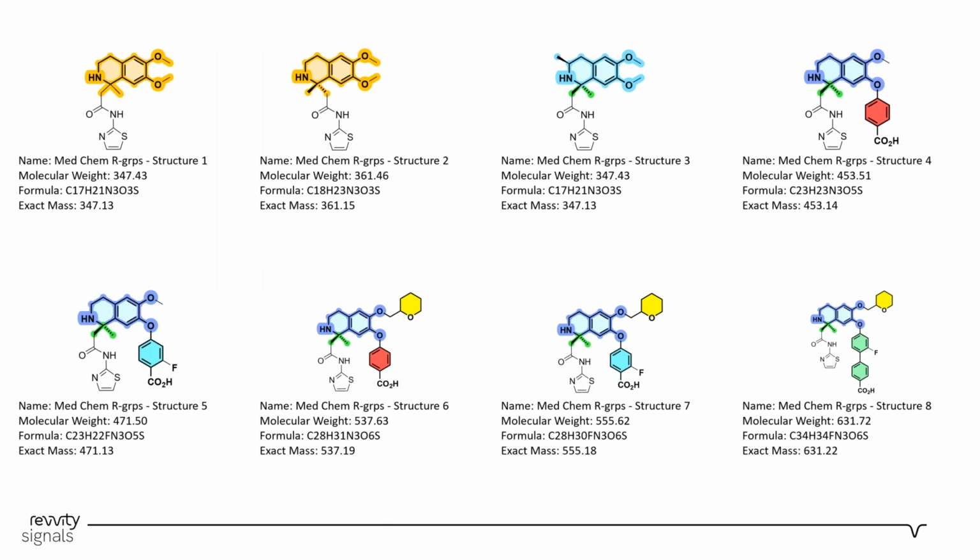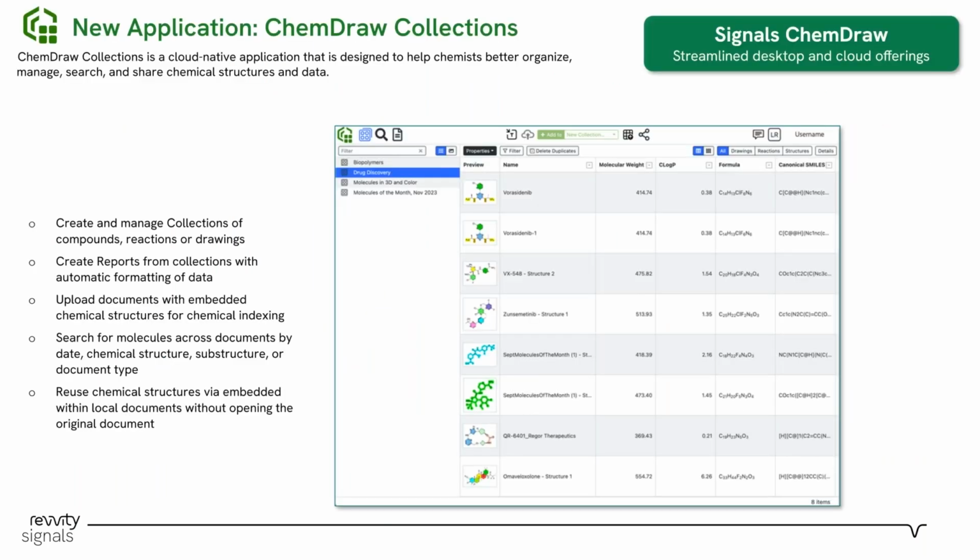This would be really, really convenient. That is the goal of ChemDraw Collections. So what this allows you to do is it's a separate application that is included with your ChemDraw subscription. And it's much like Chem3D, right? It's not embedded in the ChemDraw interface.